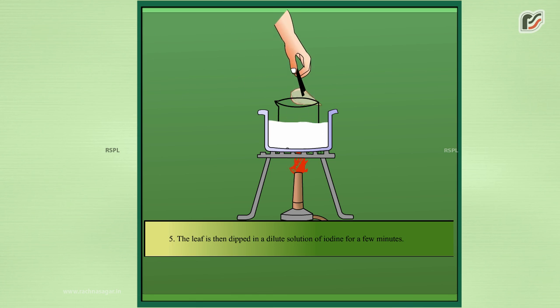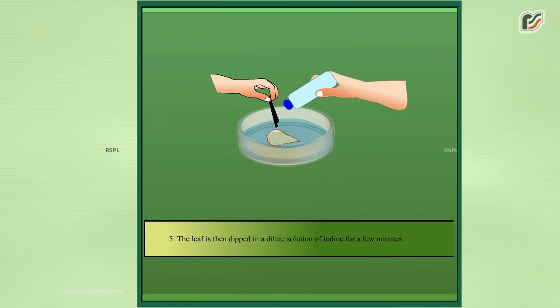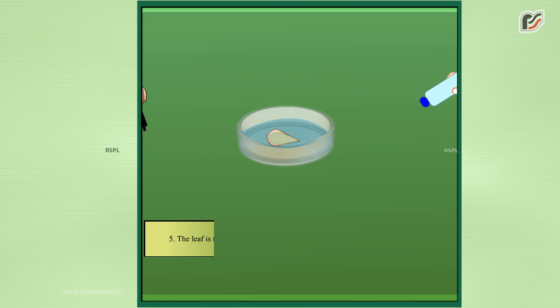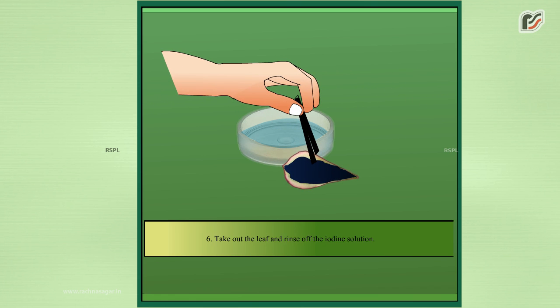The leaf is then dipped in a dilute solution of iodine for a few minutes. Take out the leaf and rinse off the iodine solution. Observe the change in color of the leaf.